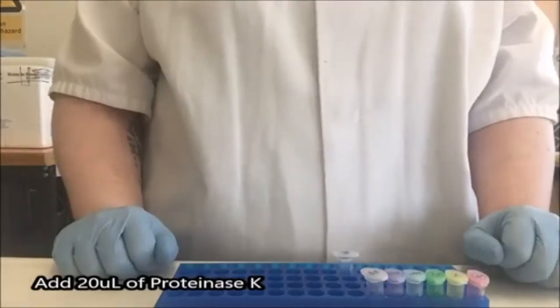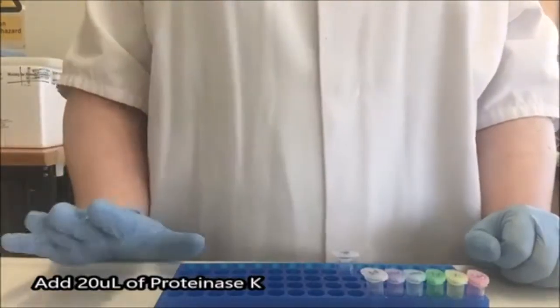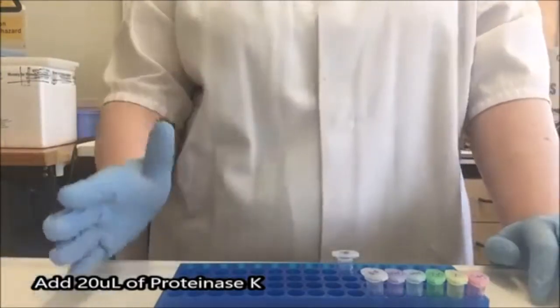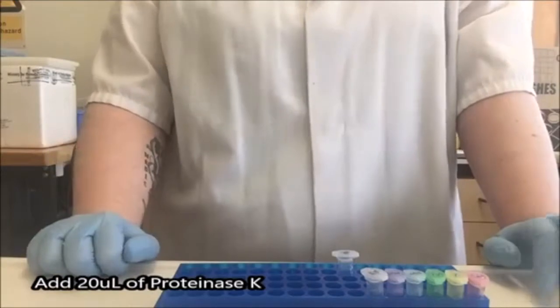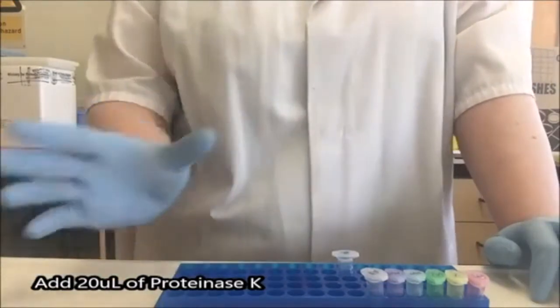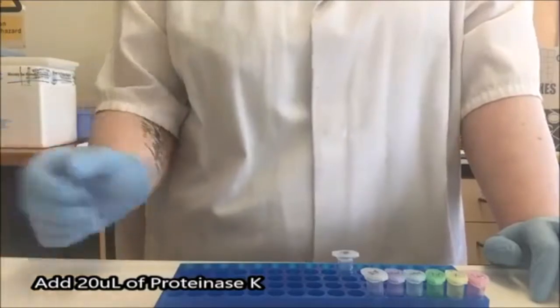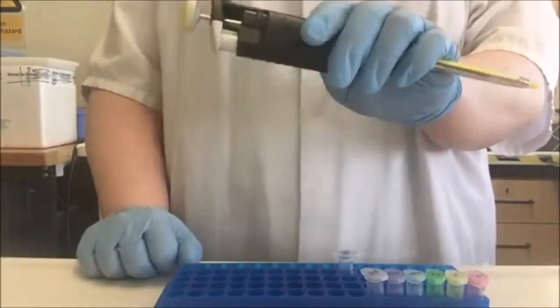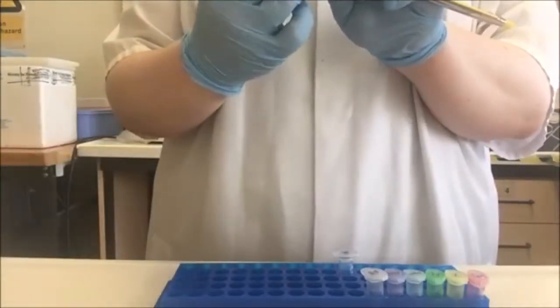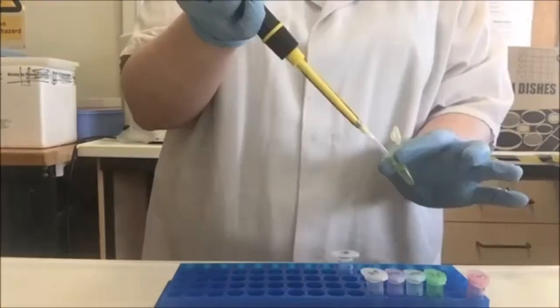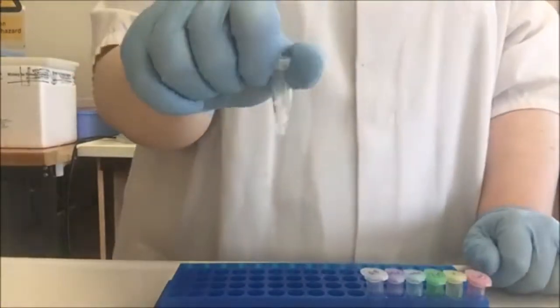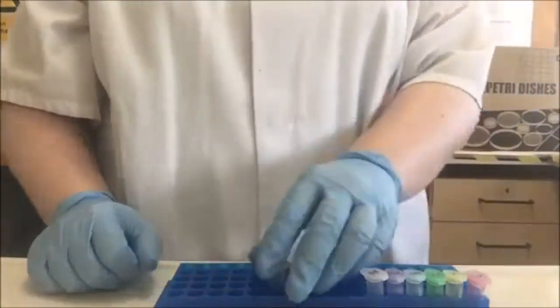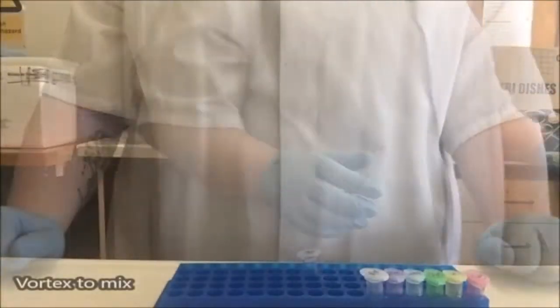The next thing I need to do is add some Proteinase K. Proteinase K is an enzyme. We know that automatically because it ends with -ase. And we know it's an enzyme that dissolves protein because it's a proteinase. I'm going to use my yellow pipette again, this time setting it to 20 microliters. I now have 200 microliters of fluid in my tube. These now need to be mixed. So I'm going to take these over to the vortex.